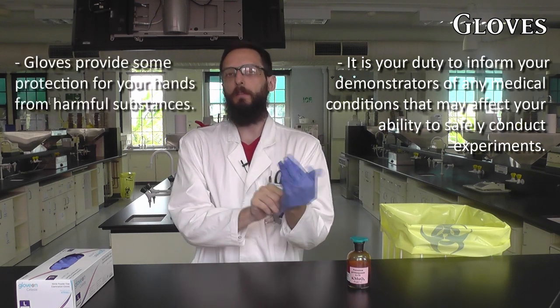When students first enter the laboratory, many of them feel the need to wear gloves all session, and that's really a waste. You should wear gloves when doing so will protect you from exposure, stop your skin from staining, or otherwise harm you via direct contact.